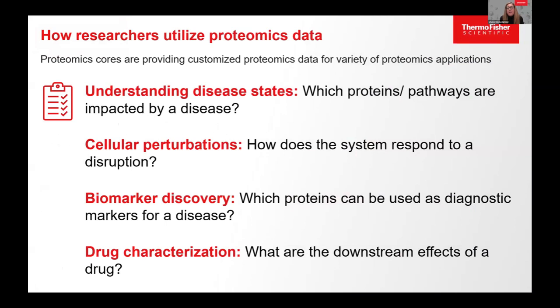We get many requests from many people asking for different things. Sometimes they want to understand disease states, which proteins or pathways are implicated, how cells are being affected by environment or medications or mutations, or doing biomarker discovery on a smaller scale.